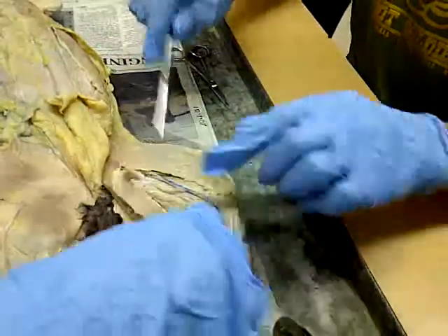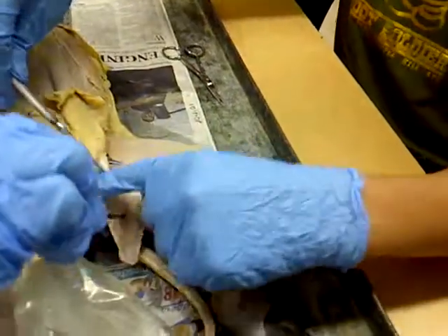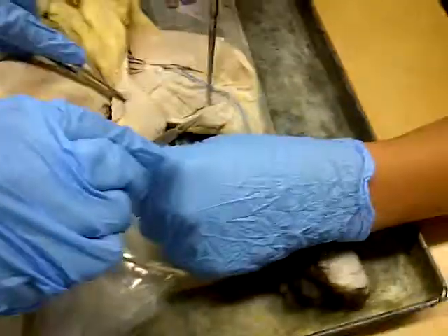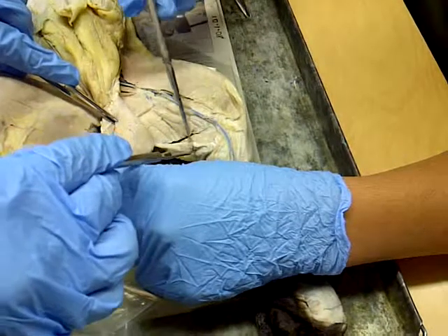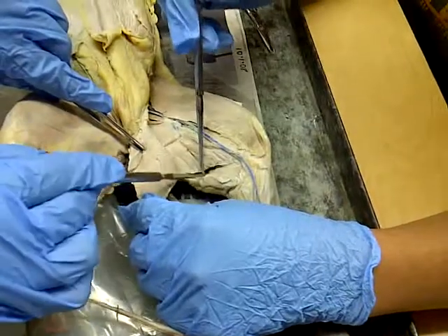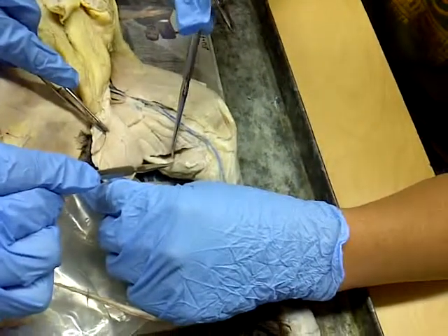As we flip this over, we'll flip the gracilis up first. So I'm going to use this instead. This section right here is called the semitendinosus. Pushing it away so that you can see the muscle separation. That's your hamstrings.